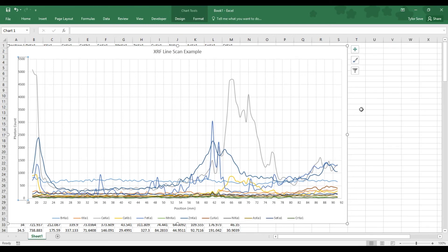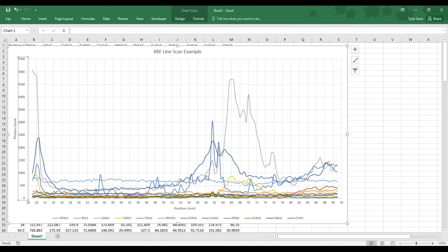Now, from here, this graph is almost done. The only thing else that we can change about this is the colors that each of these samples, or each of these elements, is color coded in. Because there's three blue ones right here that are a little hard to distinguish.